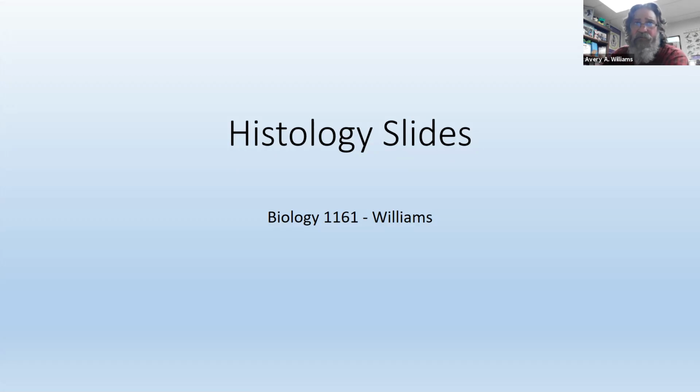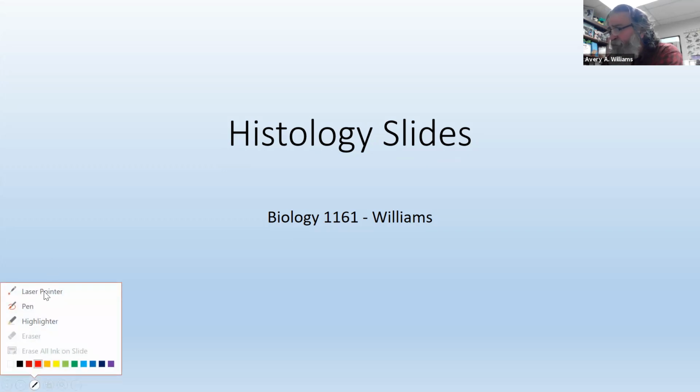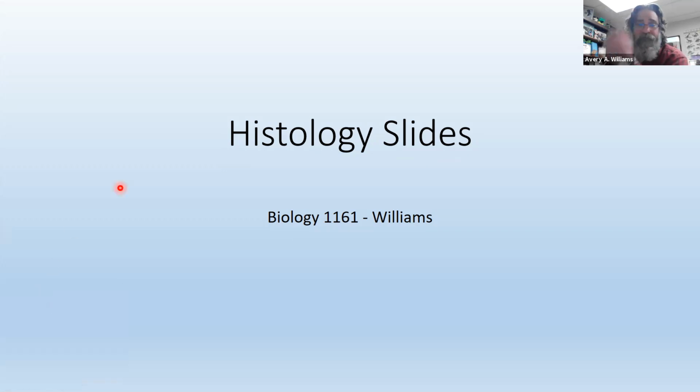And if you go to, excuse me, my courses, you'll find there's all kinds of stuff in there, but this is basically the only thing I really am interested in. This PowerPoint is the only thing I'm really going to talk about. The only thing you really need to study. Okay. And traditionally when I'm doing my histology lab, every semester I have my students study 13 different histological slides and basically identify the slide, what part of the body it came from, and then what are the tissues that they can find on them.